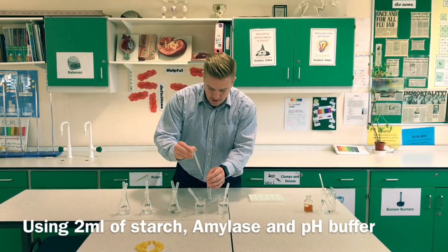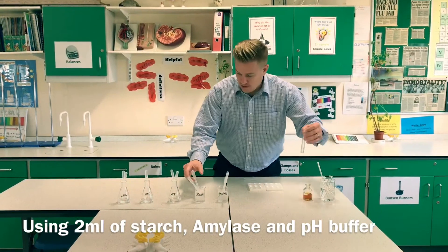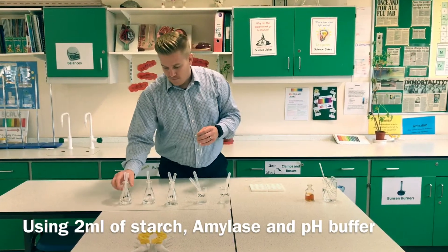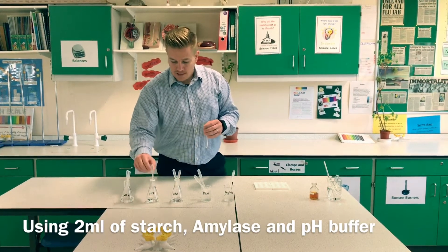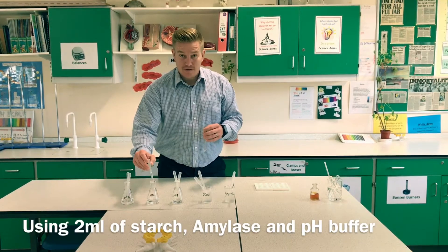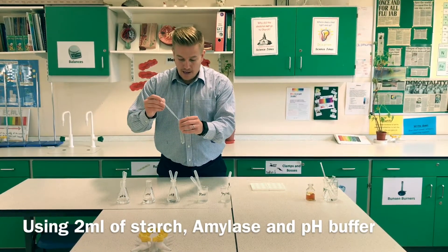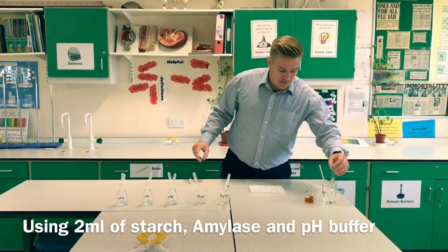In goes my starch — 2ml — and my pH buffer. I have three options: pH 4, 6, and 8. We're going to be doing pH 6, but you will have to test all three, whether you do it as a group or on your own. The same amount of amylase and starch — all separate, all in the water bath.